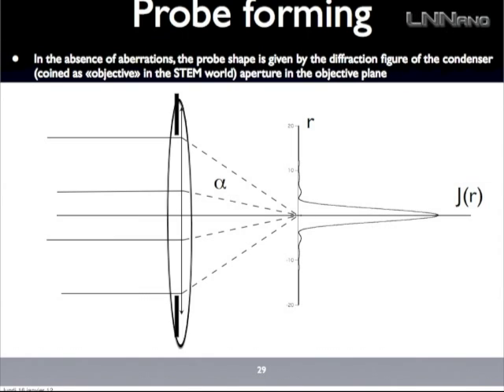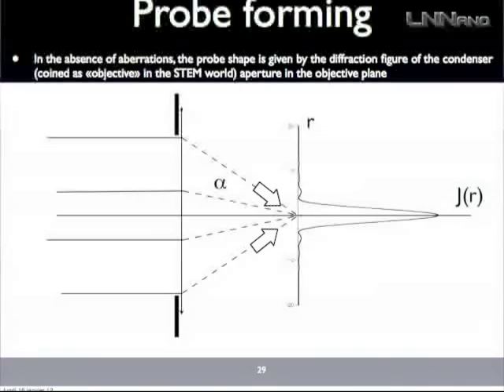And we send this beam onto the objective lens. So usually in a STEM, the beam is entering the top part of the objective lens parallel. And of course, if we put the sample here at the focal length, due to geometric optics, we will form an electron probe right here.